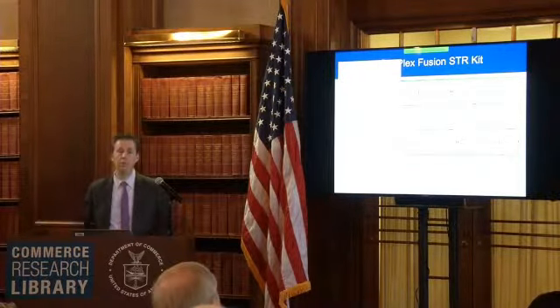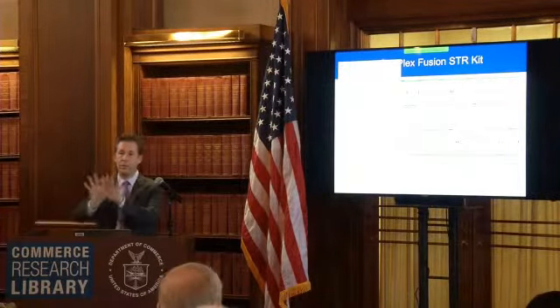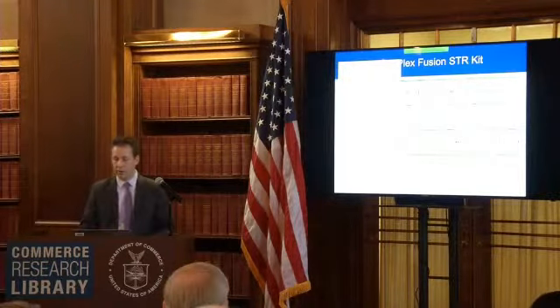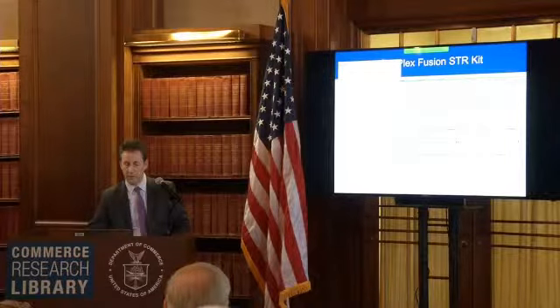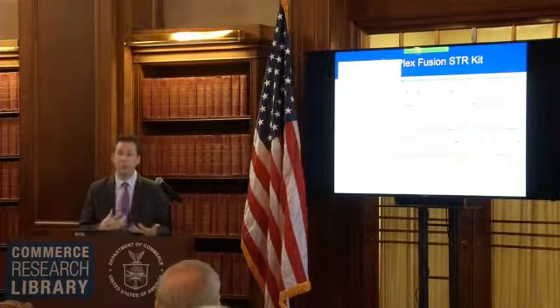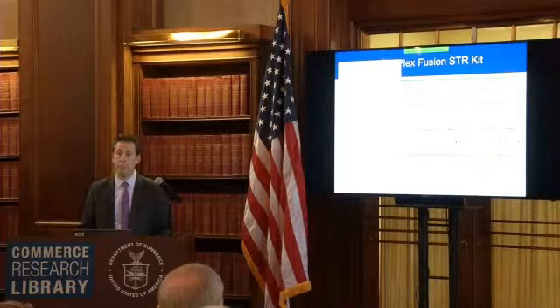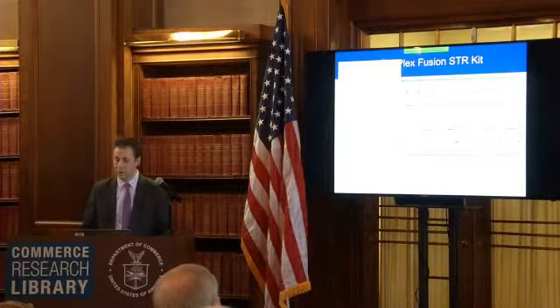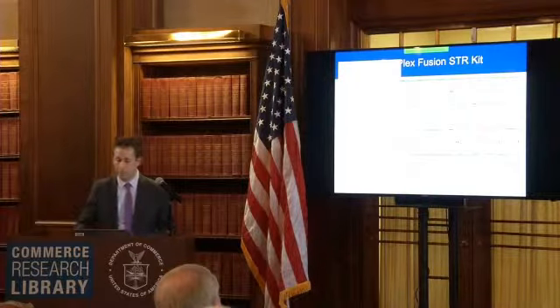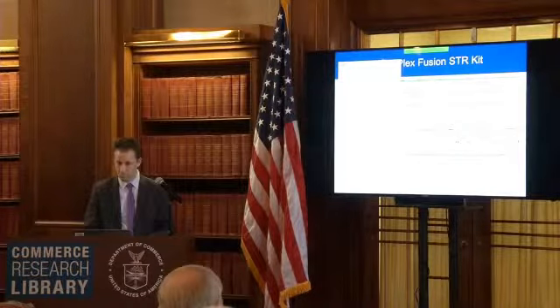Now, when we talk about putting these into a database and matching these, we're not talking about taking these peaks and trying to overlay them with another profile. Really, all the information is distilled down to the allele calls. So for each of the markers on the left here, or loci, you have the state. So it's a 15-15, 11-13. This is what gets put into a database, and this is what's searched. You're not actually searching these peaks. It's really a flat file, a text file, that's being uploaded to the database and searched. But in that sense, the profile has gone through double review, usually in a forensic laboratory, and these are confirmed here. So, yes.